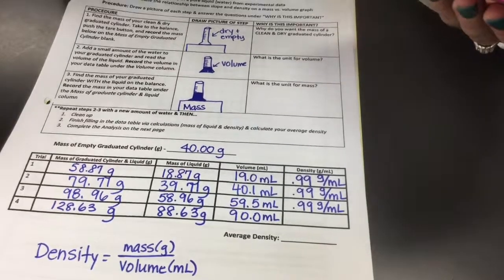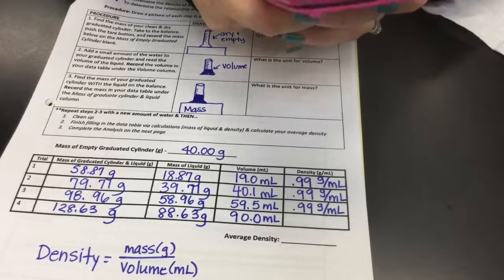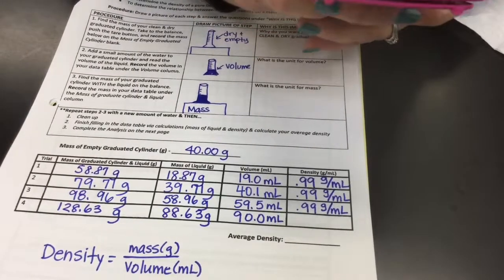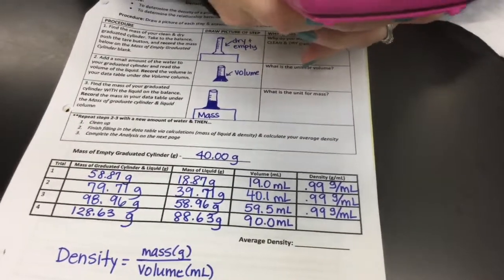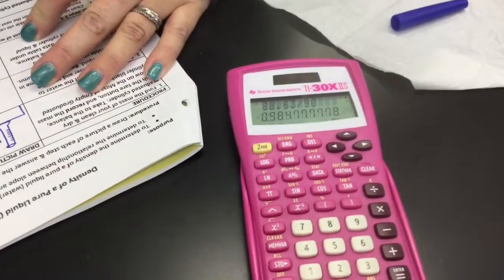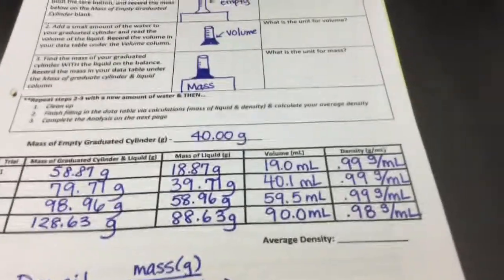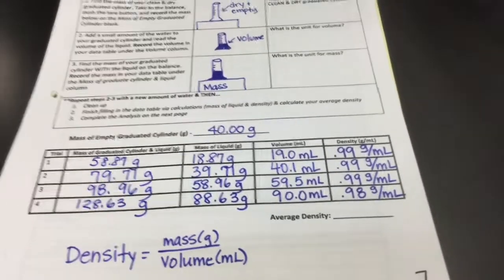All right, final test. 88.63 divided by 90. Oh, it's 0.984. All right, so I'm going to write 0.98. And now she's going to have to find the average density, where she'll add up all 4 of our densities and then divide by 4, because that's the number of data gatherings.